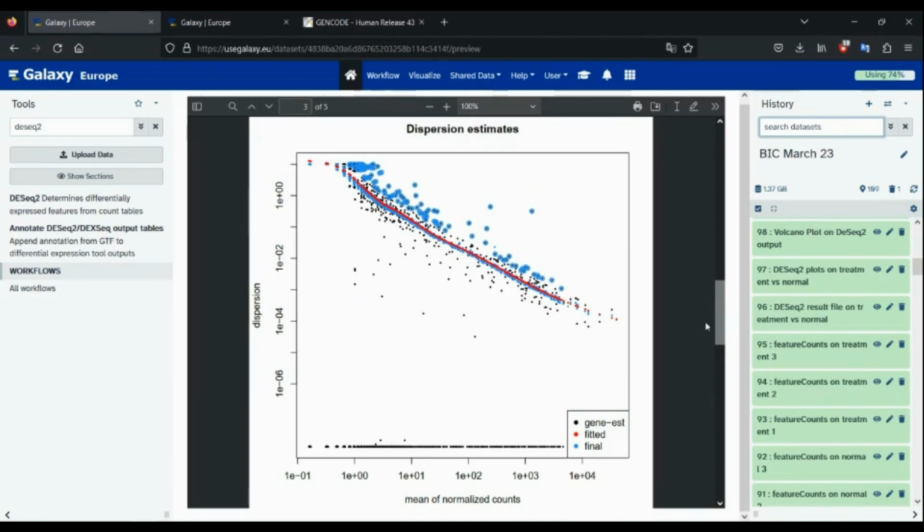Again, it's up for debate, but I feel that this is not much relevant because sometimes the plots can change. And this one, to be honest, looks quite weird because this isn't how the dispersion estimate actually looks. But since we're using only a small portion of a genome, only chromosome 22, which is quite a small chromosome, we're getting a pretty weird shaped dispersion here. Nothing wrong with it, just a general comment.